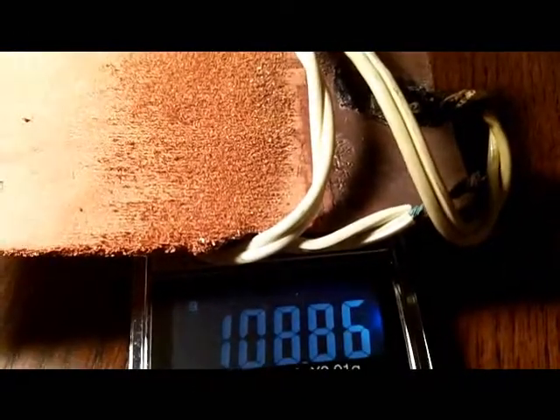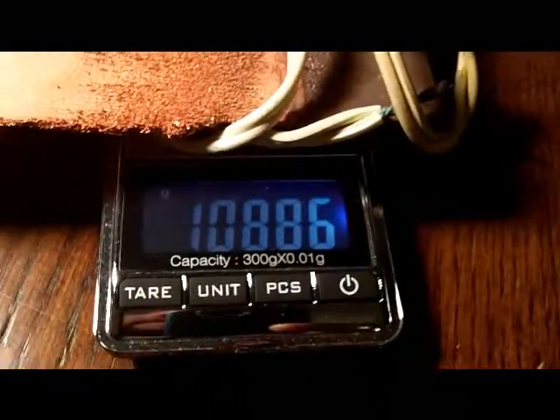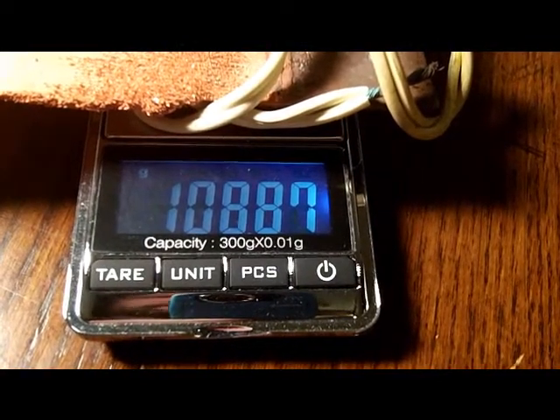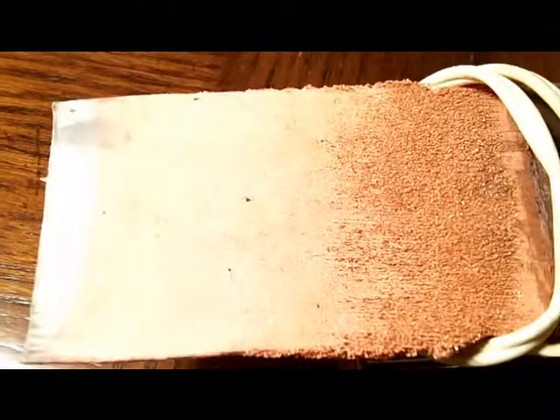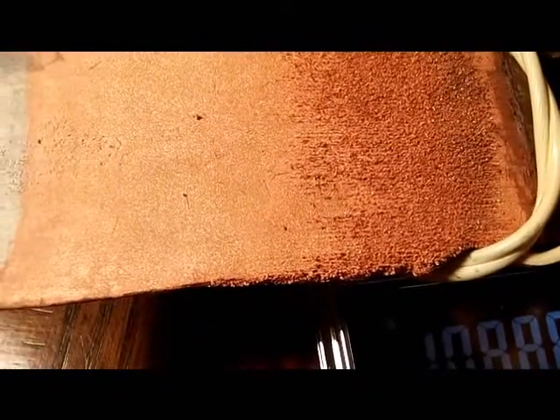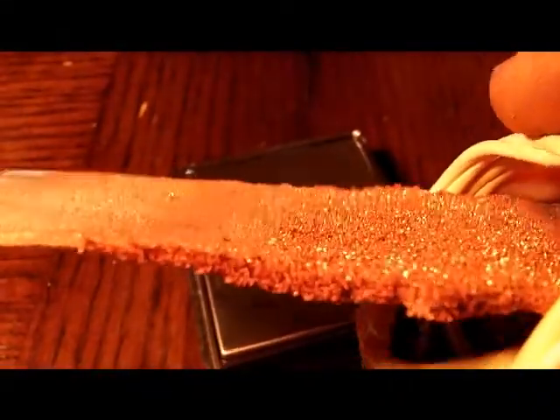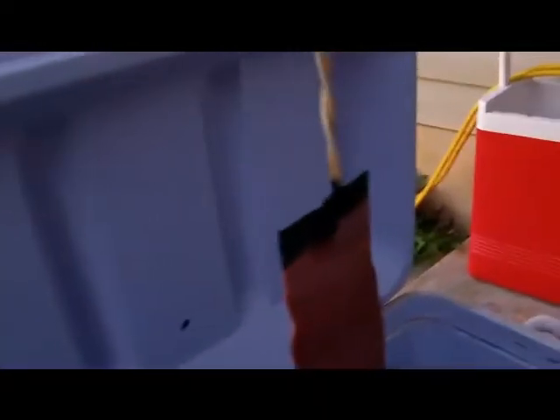I've got it dried off with paper napkins and it now weighs 108.86 grams. This process can be refined, but you do see that is pretty clean copper. The back side is fairly smooth, the bottom is fairly smooth, but near the top it looks like we had a higher charge density and a faster rate of deposition, so it started getting kind of rough. Pulling the plate out — looks like we're still accumulating some metal.